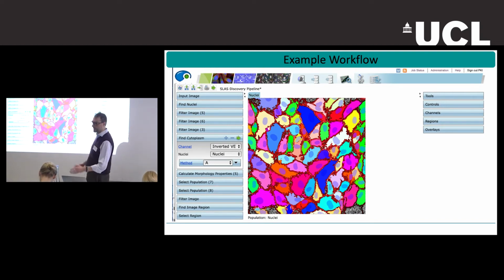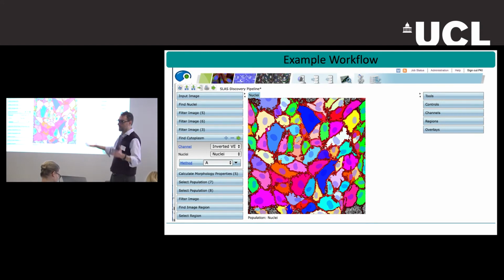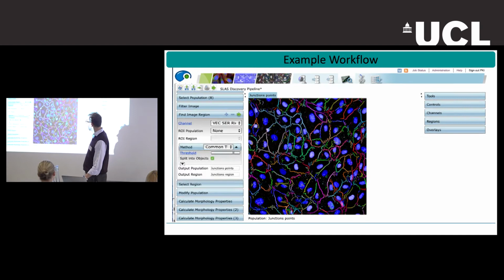Obviously, endothelial cells tend to overlap, but very slightly. And so at a certain point, you might question whether a region pertains more to this cell than to this other. It's not really important when we explore a large number of cells, because the majority of the characteristics will weigh more on the general result. Once we found the cell, we wanted to characterize the junctions. So with one staining, we're already obtaining two pieces of information, which is interesting.